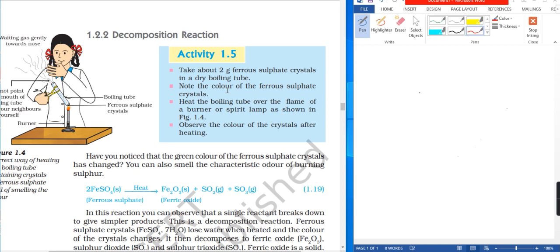Heat the boiling tube over the flame of a burner or spirit lamp as shown in the figure. Observe the color of the crystals after heating. In this activity, the ferrous sulphate crystals have changed.